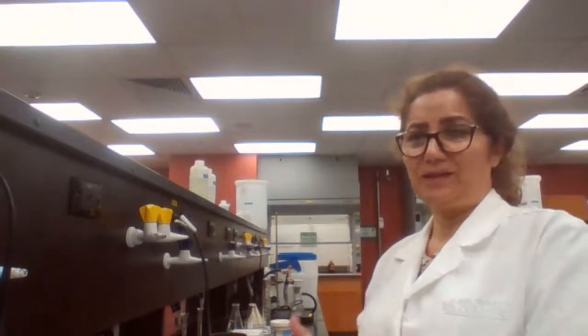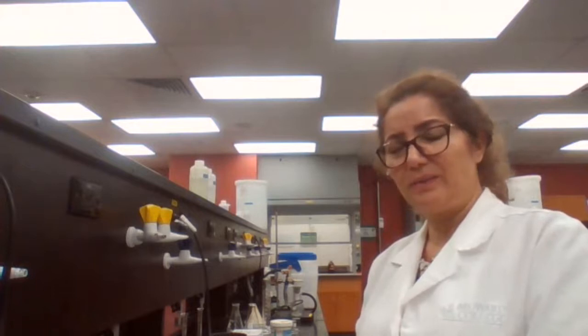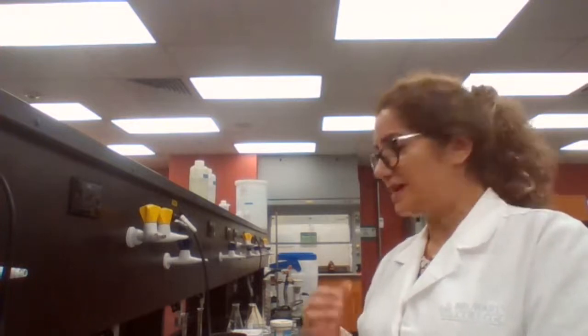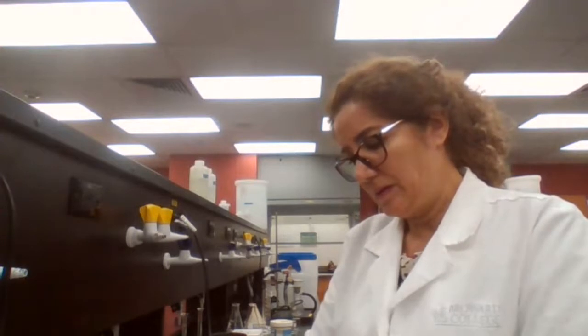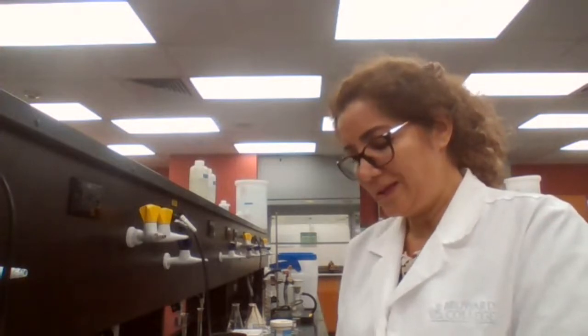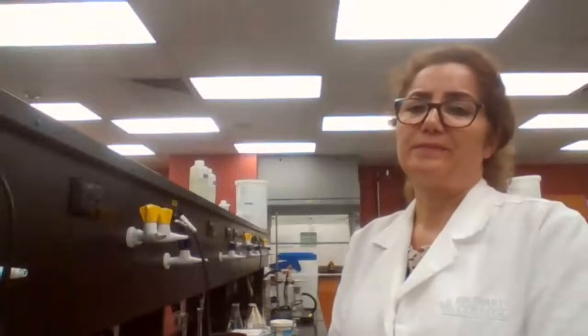You don't want to place it in ice right away. What is the problem with placing your sample in ice? You take it from the hot plate and you place it in ice right away. What would be the problem with that? A sudden cooling of the solution is going to cause a problem. What is the problem? You have to cool down the solution to room temperature first before you put it in the ice bath.